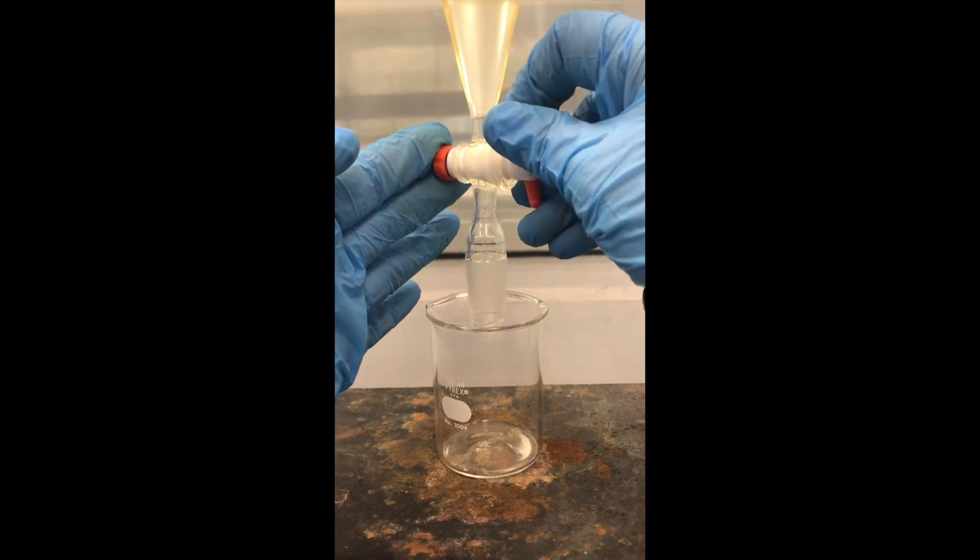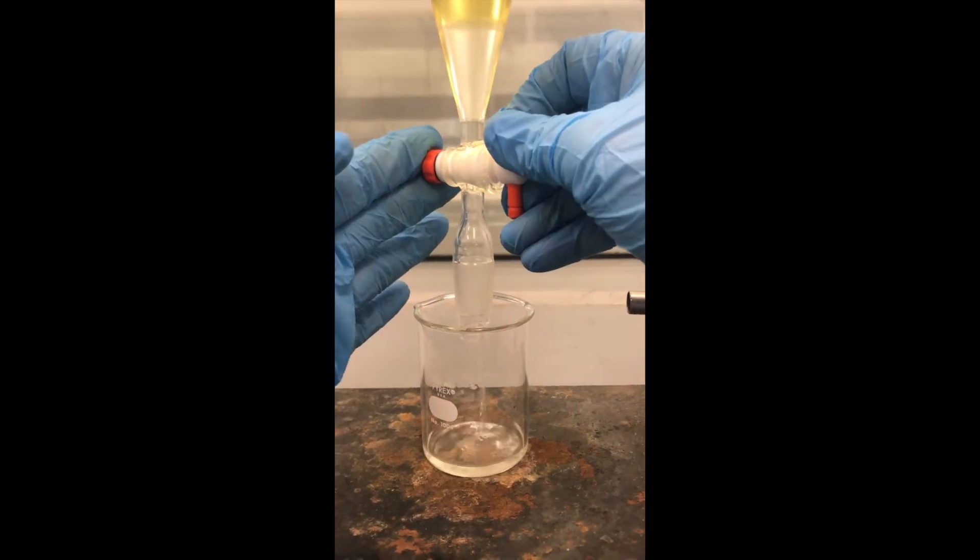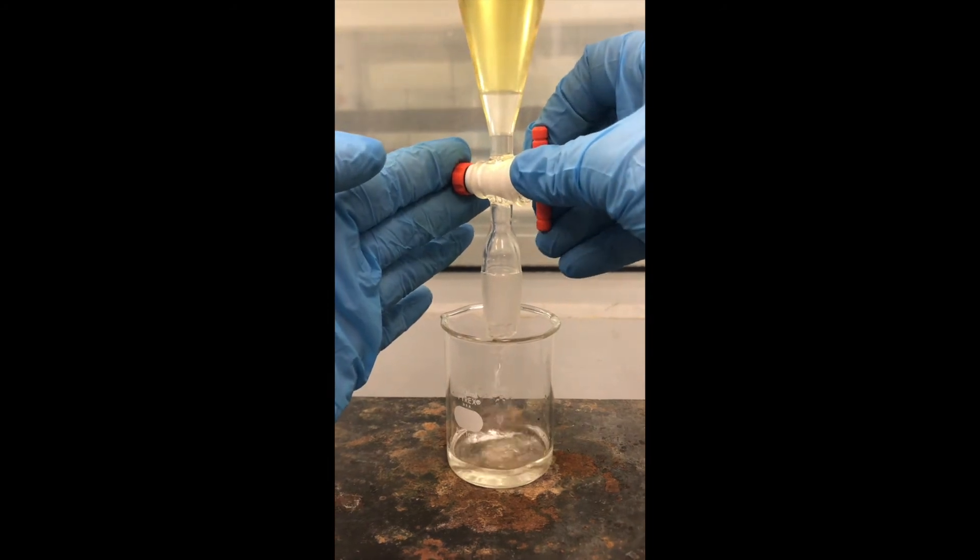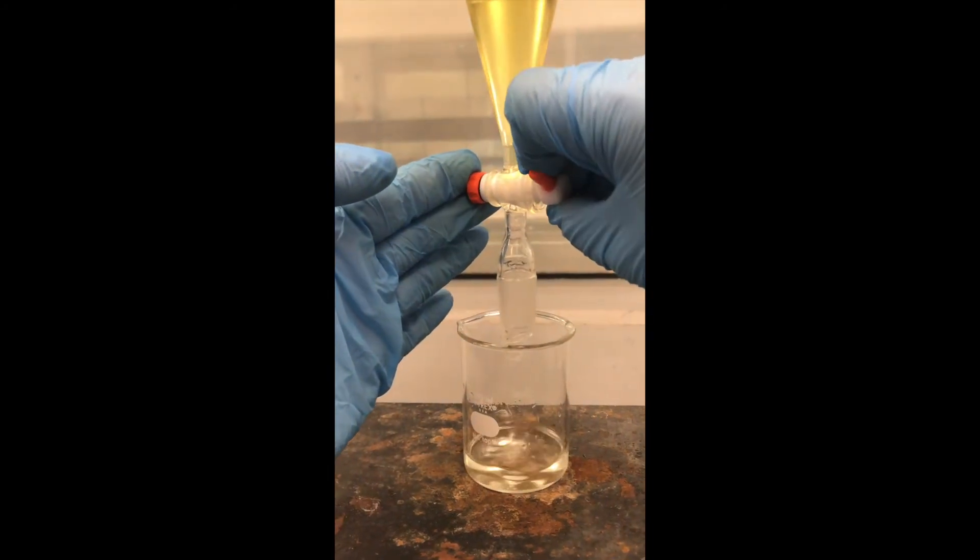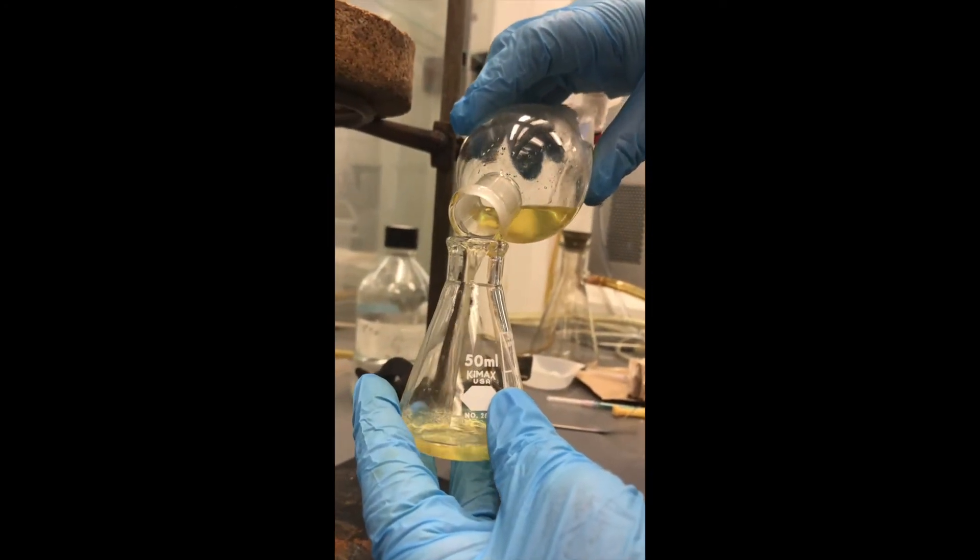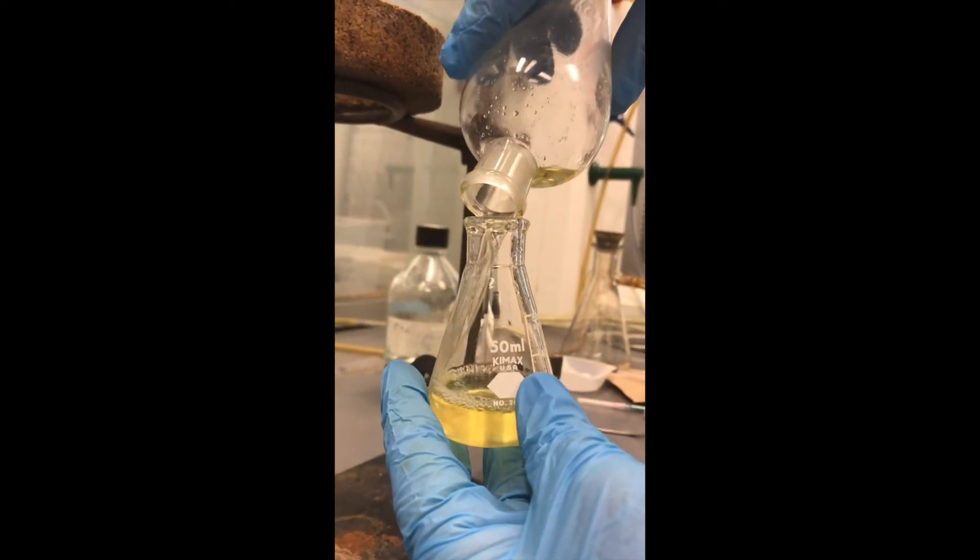During my extraction, I will pull off the aqueous layer through the bottom of the funnel. Remember, my product is in the ether. I am going to need to save this aqueous layer to wash it one more time with the ether. I am also going to save the ether layer, but this time I am going to pour it out of the top of the funnel to avoid contamination with the aqueous at the bottom of the funnel.